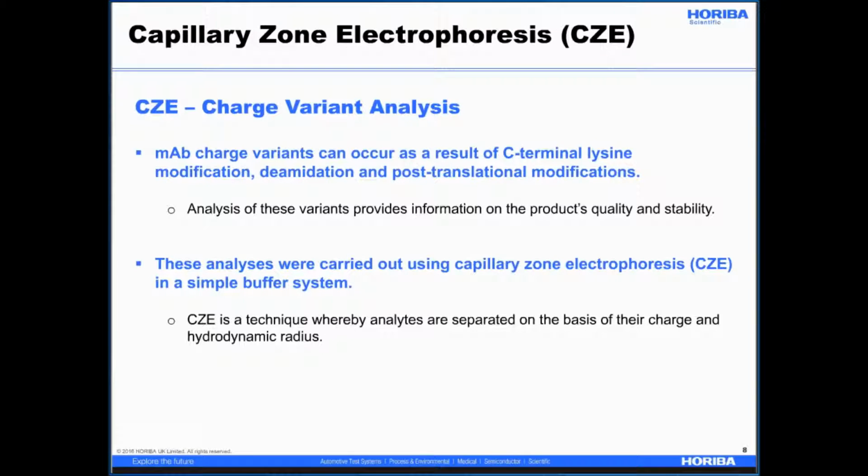For all the CZE experiments, minimal sample preparation was required. The samples were diluted into sample buffer and then placed directly into the instrument for running. This quick sample preparation protocol results in significant time saving for the user.